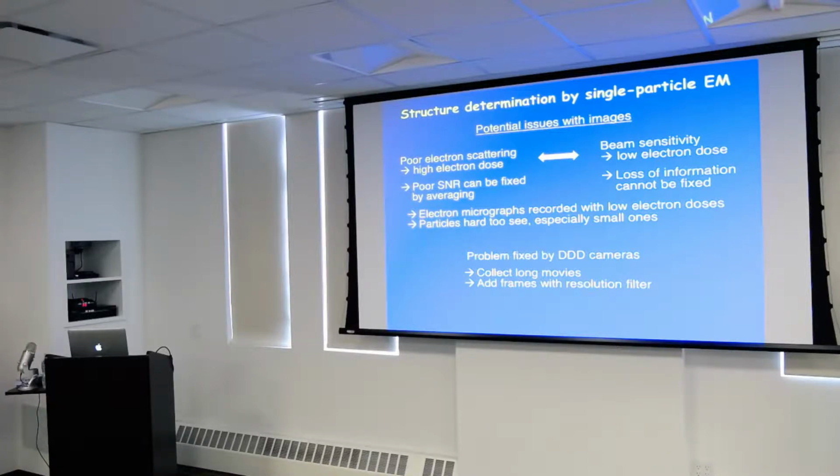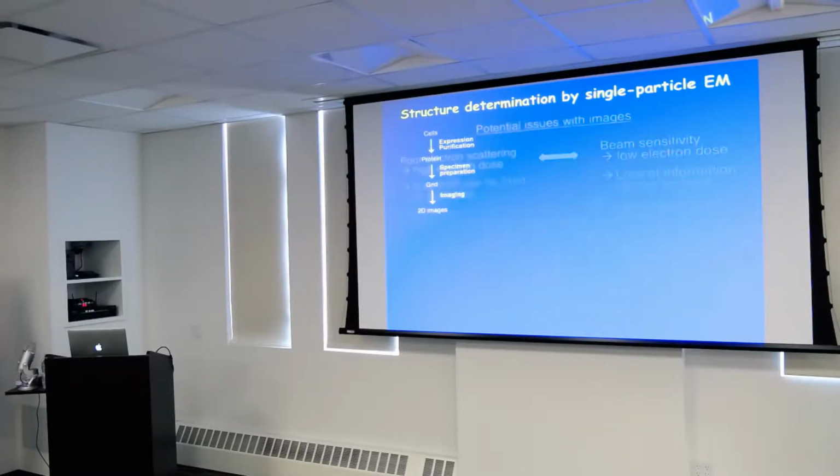And we still have a problem if we get to very small molecules, but then you can use phase plates and so on. So basically imaging is almost solved, and most people collect the data pretty much in the same way, irrespective of the specimen.